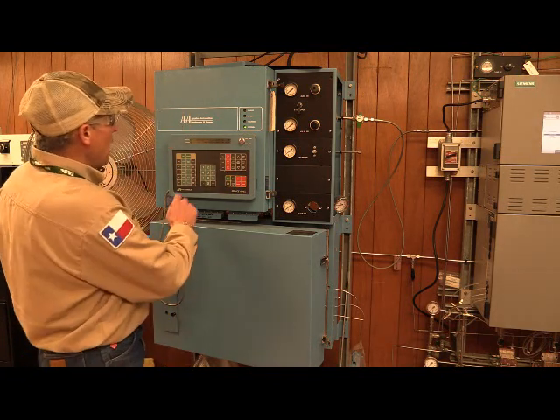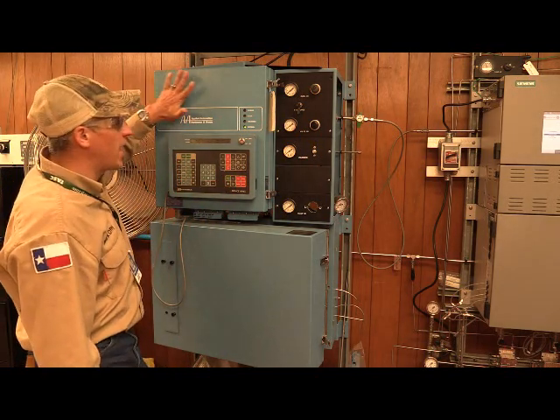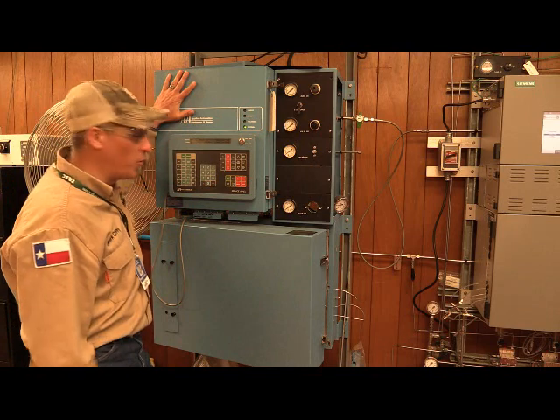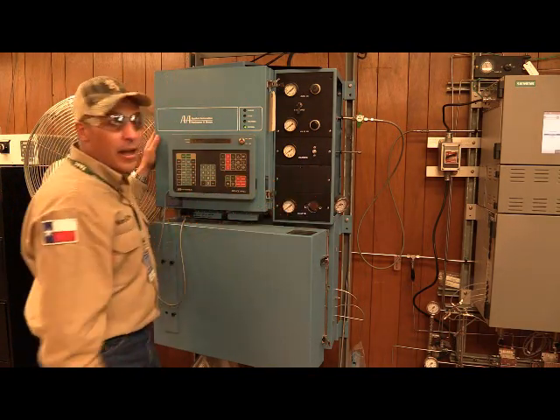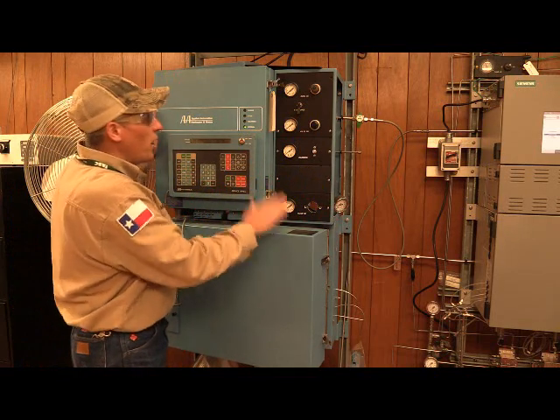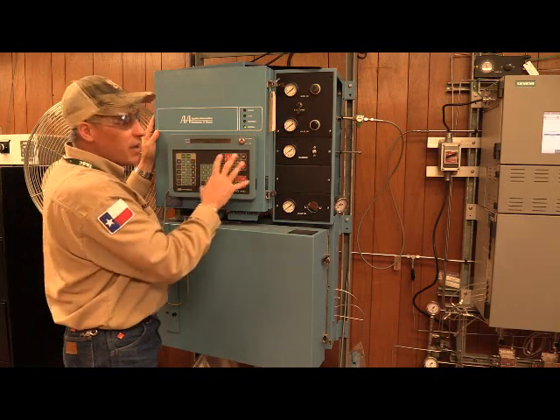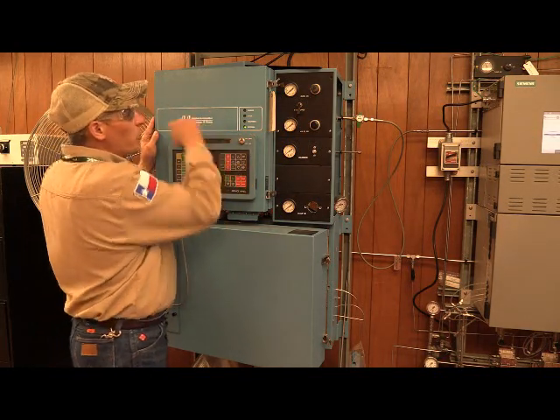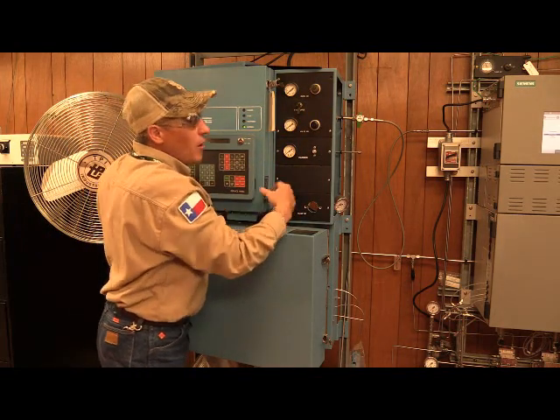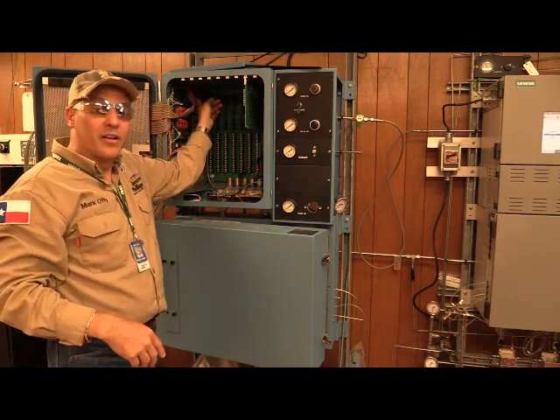Anyway, analyzer display will take you to the main screen of the analyzer that you are plugged into. Analyzer display will take you to this guy. If you're on a network with other ones of these, then you would hit analyzer 1 display for this guy, analyzer 2 display, and you will talk through the data highway over to the other analyzers.